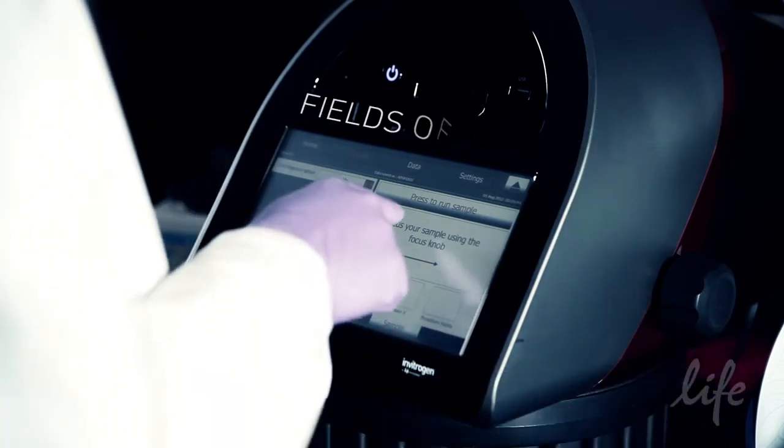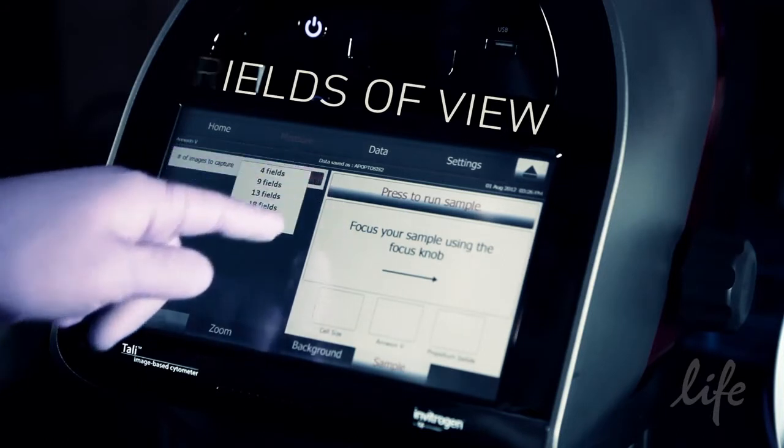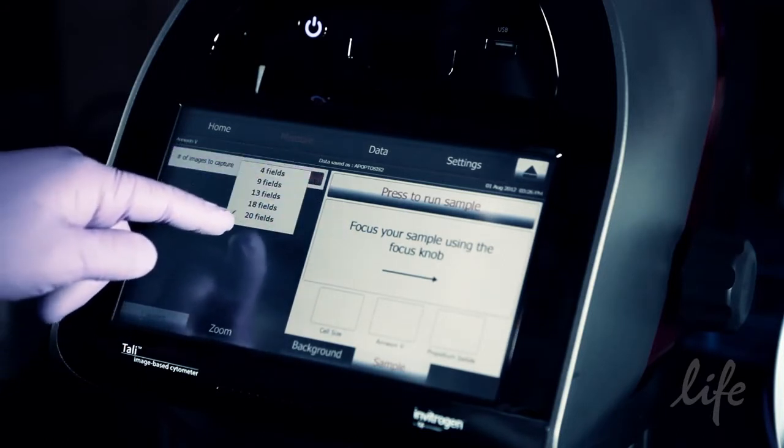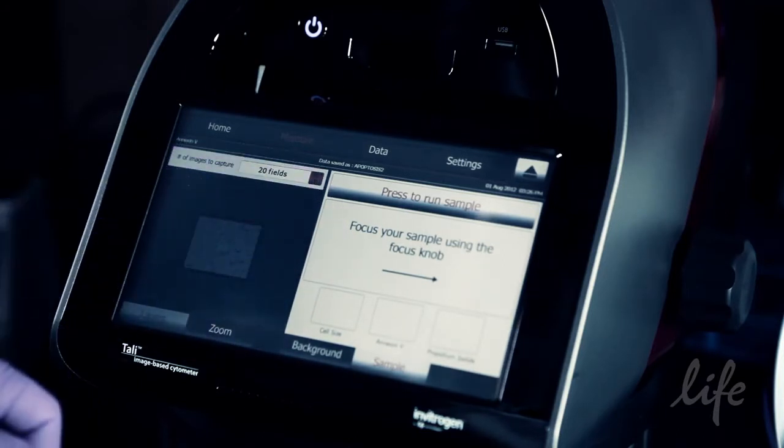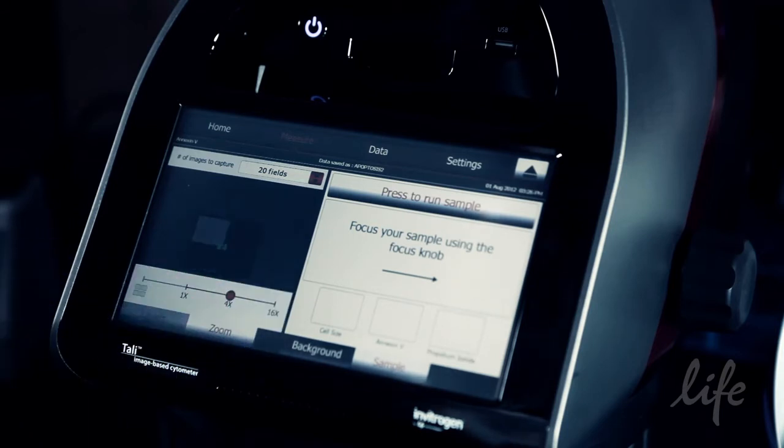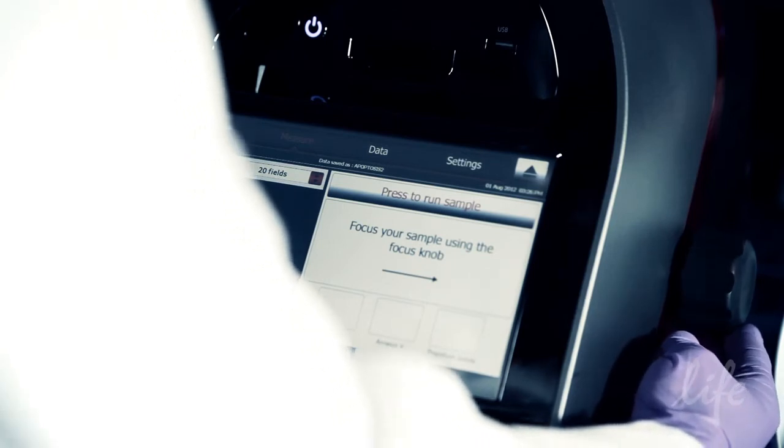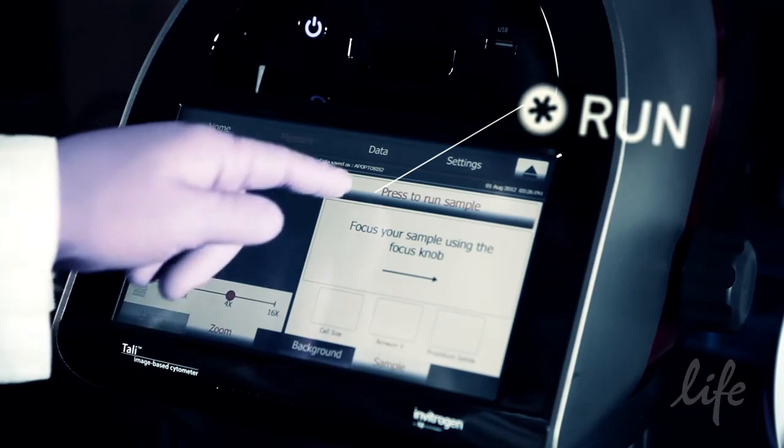To specify the number of fields of view to capture, touch the arrow button on the Number of Images to Capture drop-down menu and select from the available options. The more fields of view analyzed, the more powerful the statistical analysis. Touch Press to Run Sample.